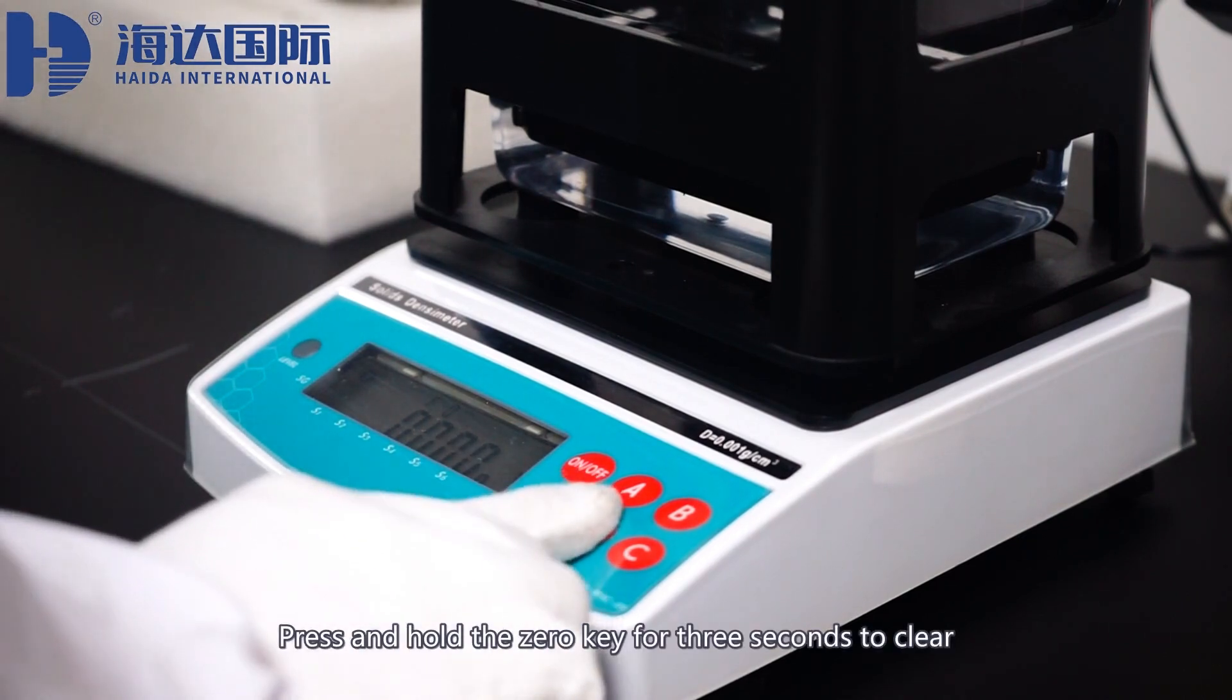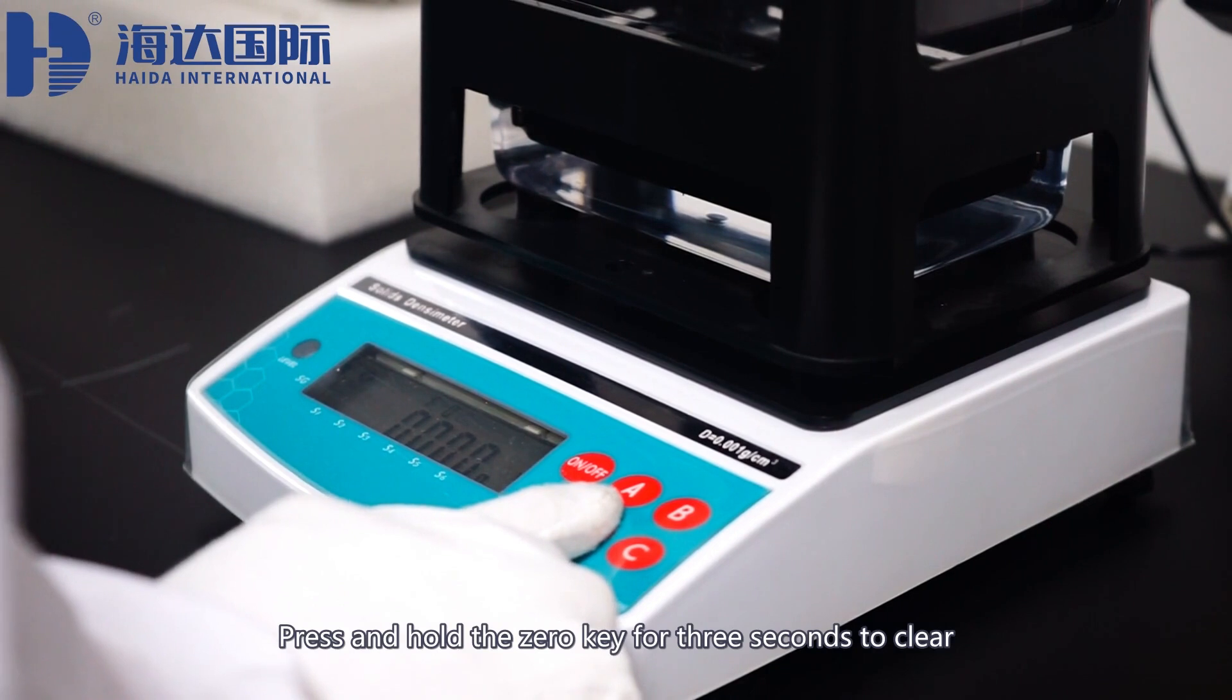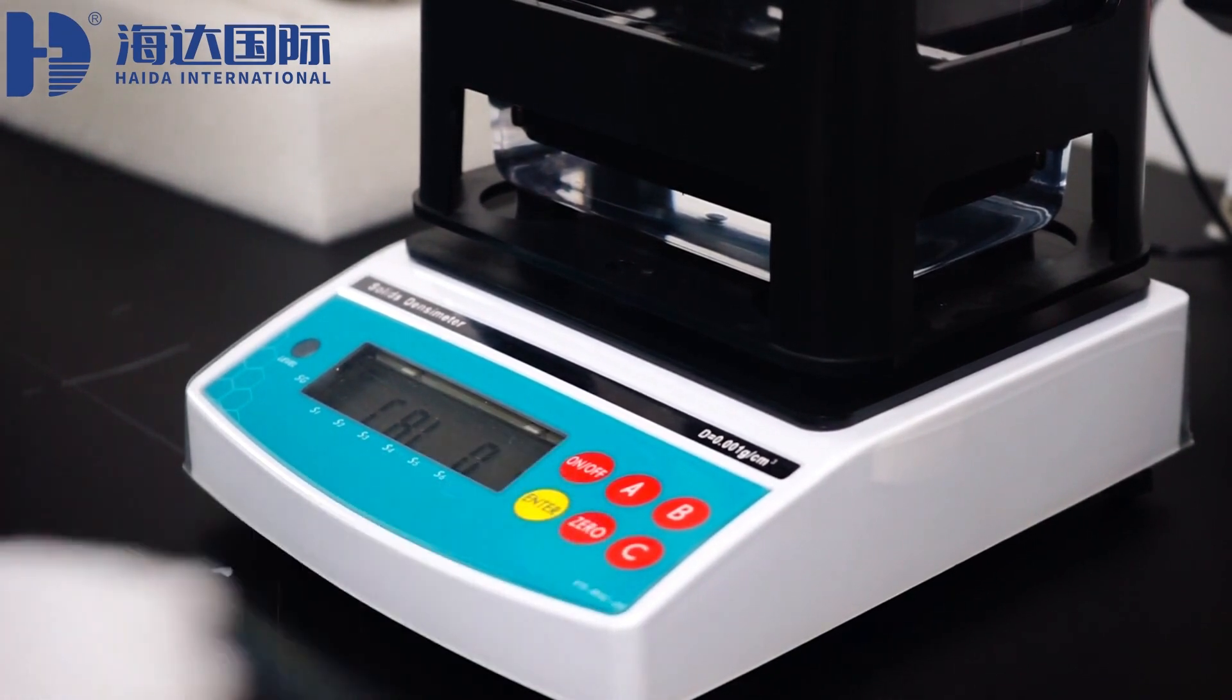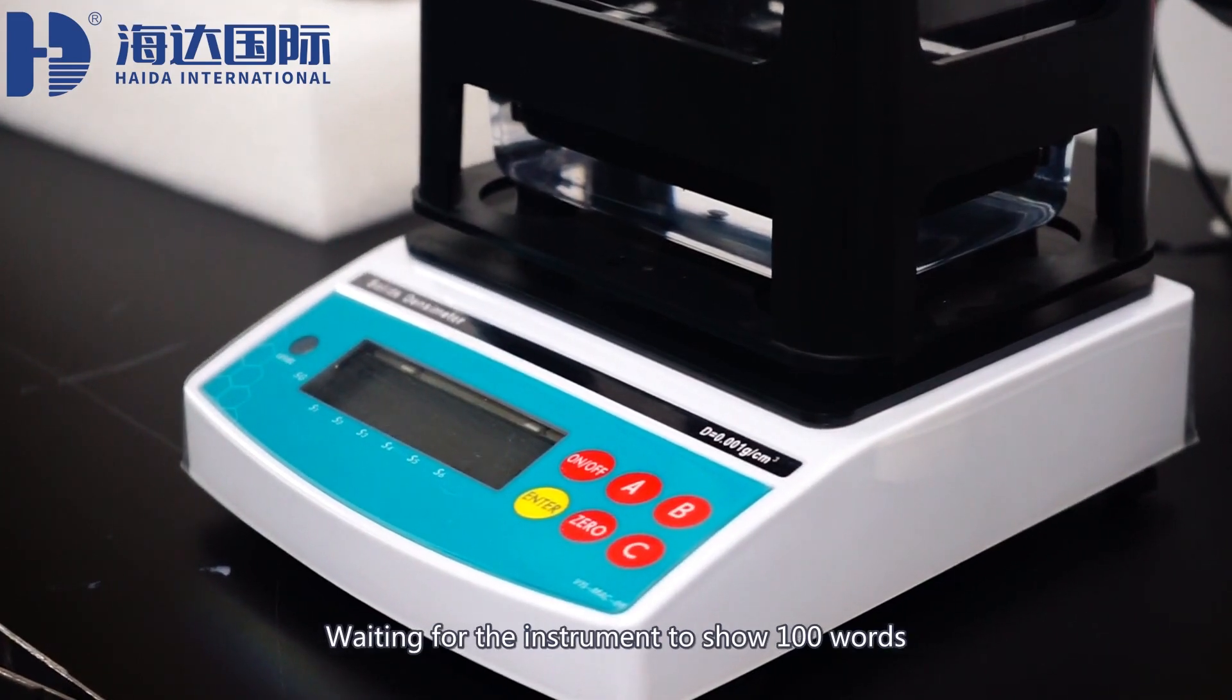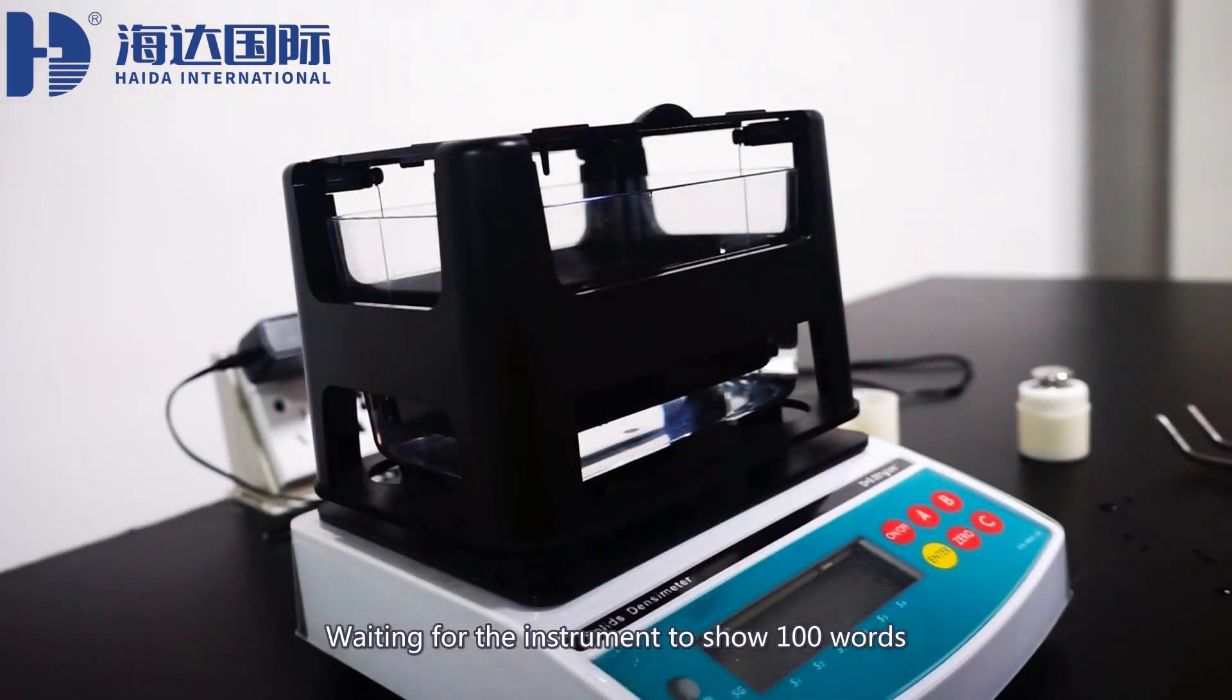Press and hold the zero key for 3 seconds to clear. On screen display of the CRL logo, waiting for the instrument to show the calibration value.